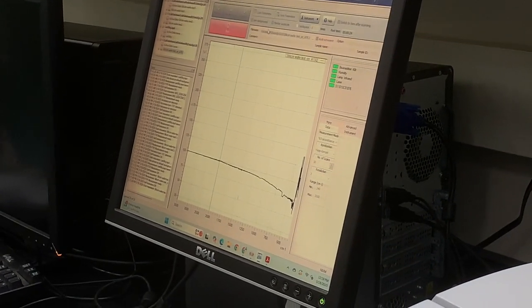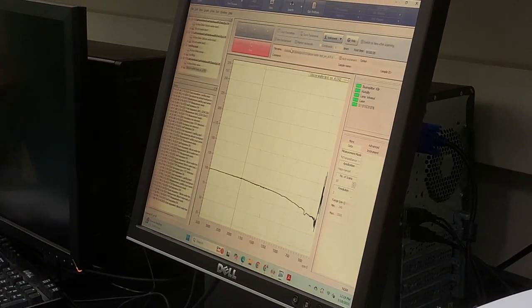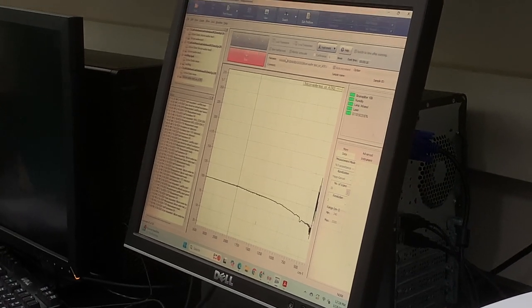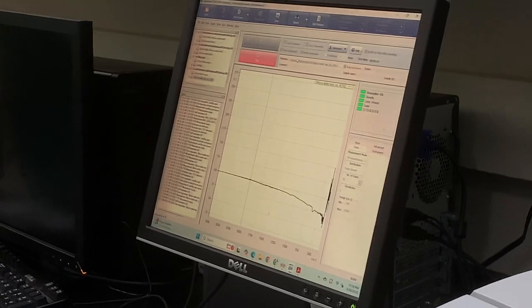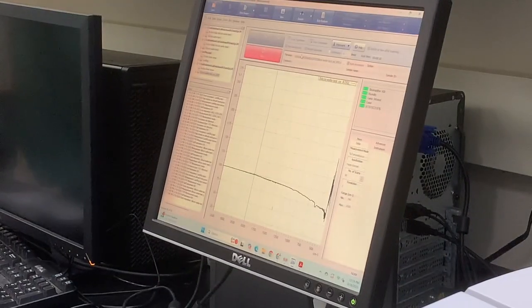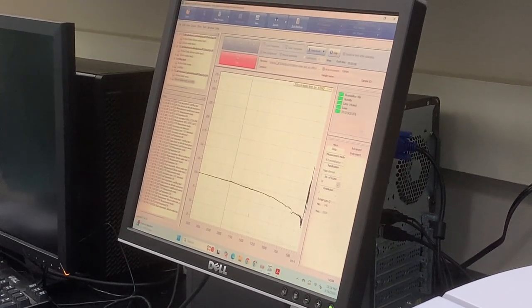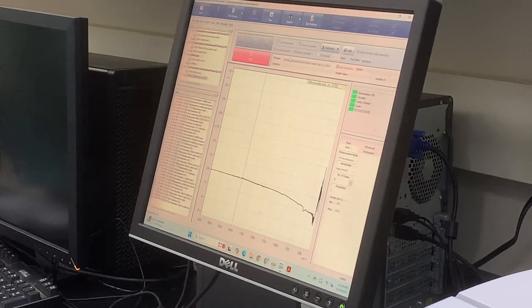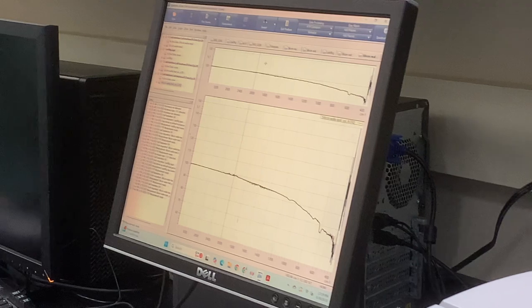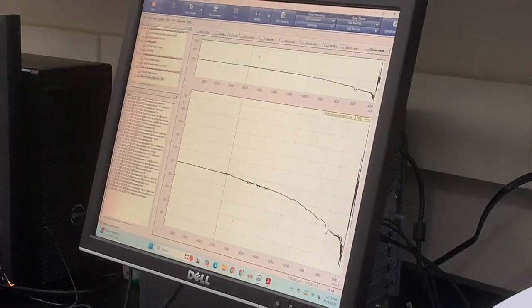Well, more scans will give you more signal because the signal should be in every scan, but the noise will vary between different scans, so it won't add up as fast as the signal will. So the more scans you have, the stronger your signal should be. Exactly. Have I sent you an application note? I wonder how many scans we did in the application note I sent over to you. I remember. Yeah, I think we have the number of scans.